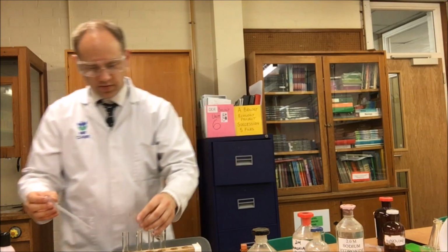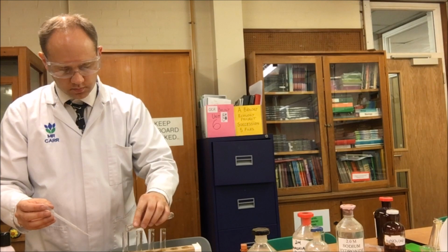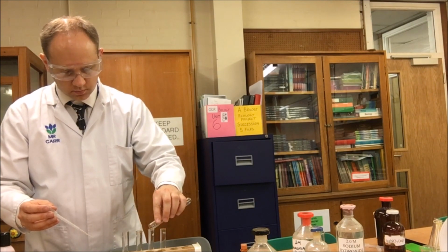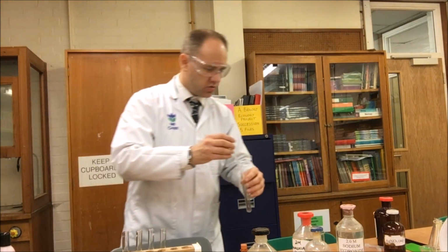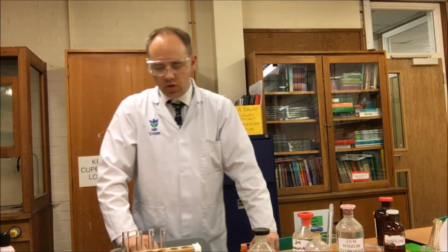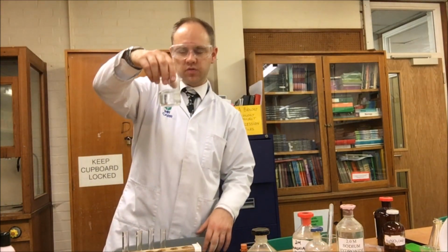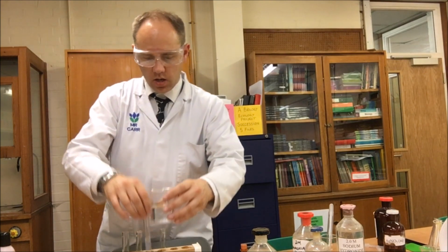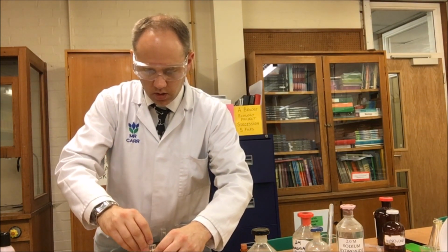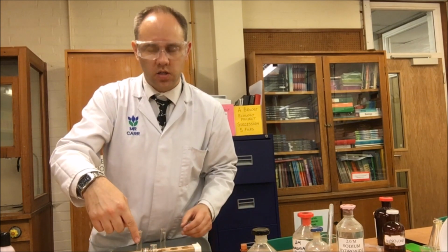Now we may as well use all of it. Now then, with the Tollen's reagent, to make sure that the reaction actually happens for the unknowns, we need to put it in a hot water bath. So I've got myself a small hot water bath here, and I shall place this inside like so. Remember, the acetone is on the right, the aldehyde is on the left.